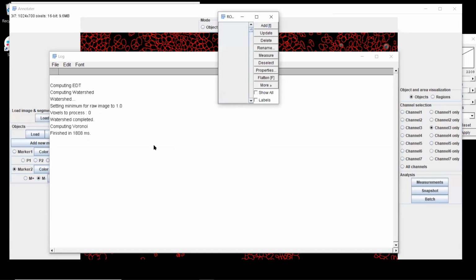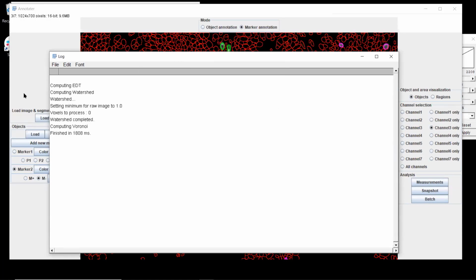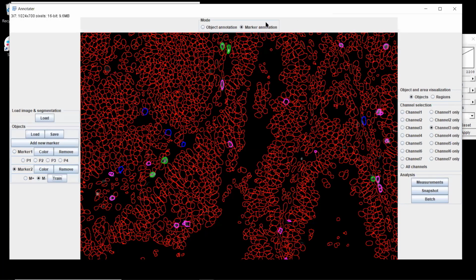And so here it takes time because it needs to extract the nuclear membrane, but when it's done, you can do it again, and it's going to be fast now. So then you can update. For example, this should be negative, so I'm going to change the label. And this, I think, should be negative as well. Do we miss some? I don't think so. So then I can train it again, and you see it updates your results.